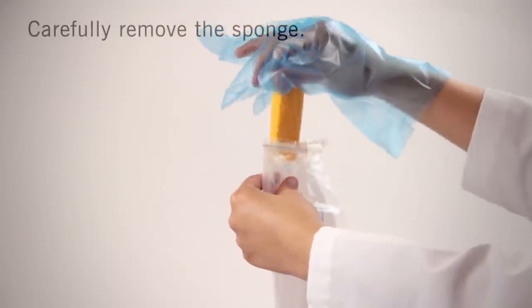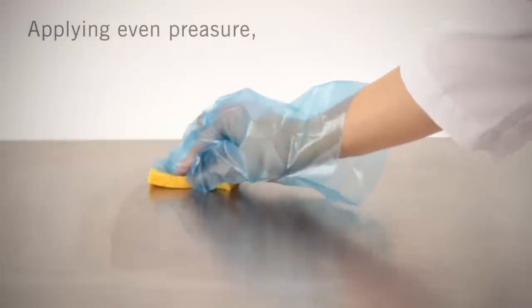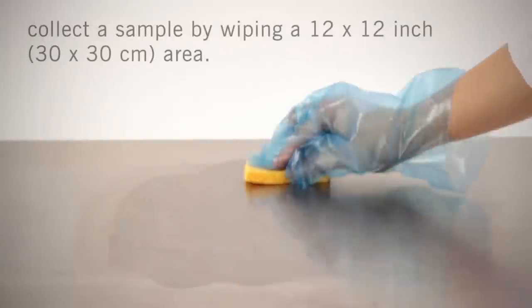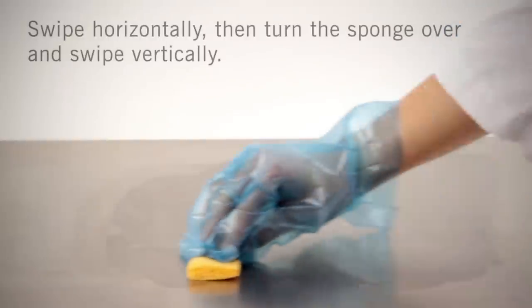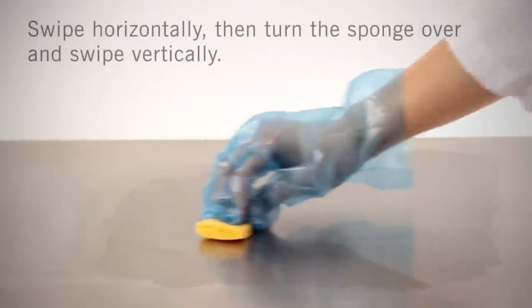Carefully remove the sponge. Applying firm pressure, collect the sample by swiping a 12 by 12 inch area. Swipe the entire area of interest horizontally, then turn the sponge over and swipe the same area vertically.